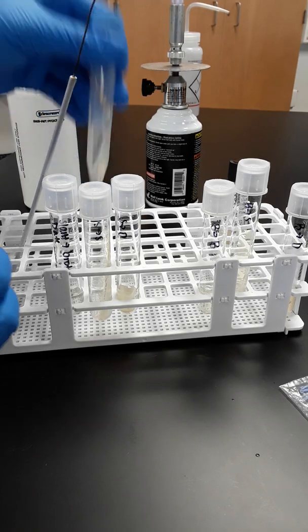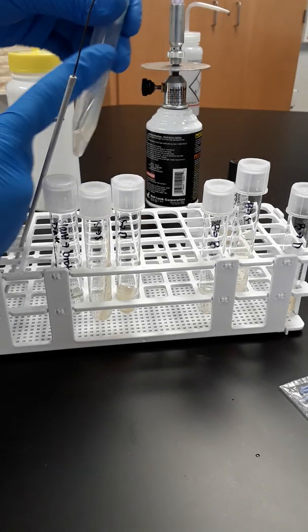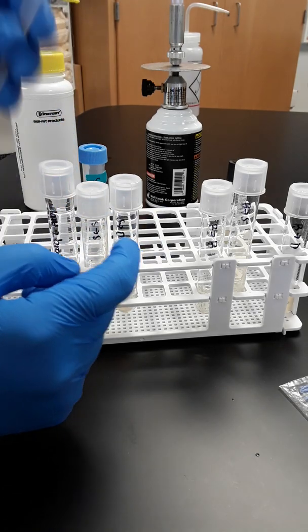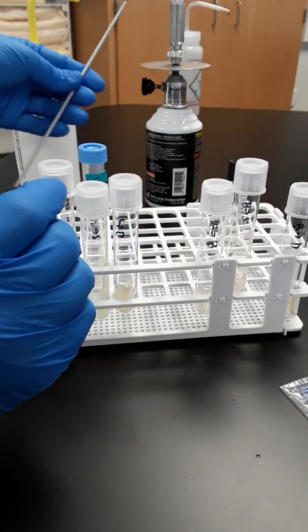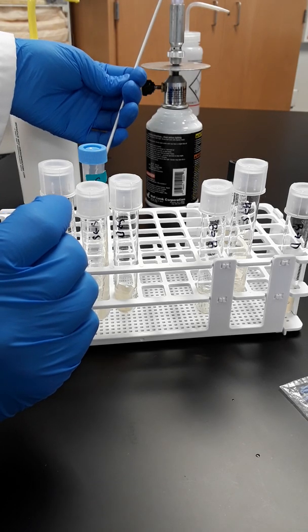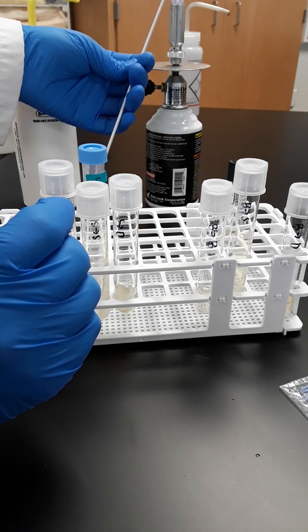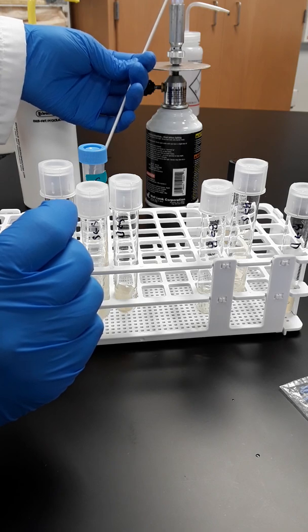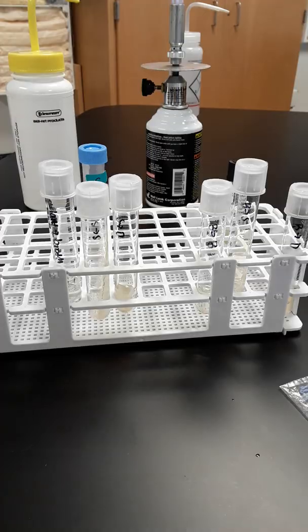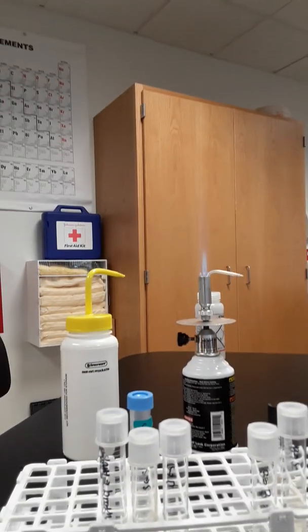I'm just going to show you the transfers from the slant. So you can see here it's at the angle onto these, and then we'll do the broth. So first up, and in between each, you want to heat up your loop. You can either heat it from holding the handle from the bottom and making sure, I want to tip this up so you can get a better view.